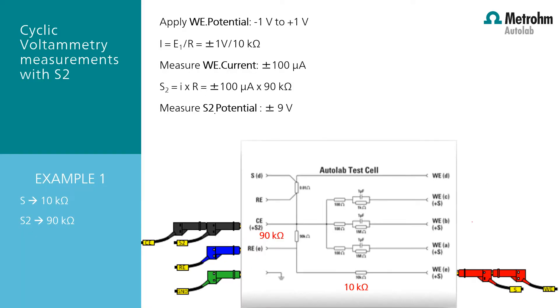To test the functionality of the S2, there is a specific circuit on the Ortlub test cell. When running the default cyclic voltammetry potentiostatic procedure from the Ortlub library, the potential between the reference and the sense is applied from minus 1 volt to plus 1 volt. The current Vionic is going to measure will be, with respect to Ohm's law, 1 volt divided by 10 kilo ohm, which results in 100 microamp of current flowing between the counter electrode and the working electrode. The S2 measures the voltage difference between the reference and the S2. The resistance between the reference and the S2 is 90 kilo ohm in this Ortlub test cell. If we multiply this with 100 microamp current, it will result in a voltage measurement of 9 volt.